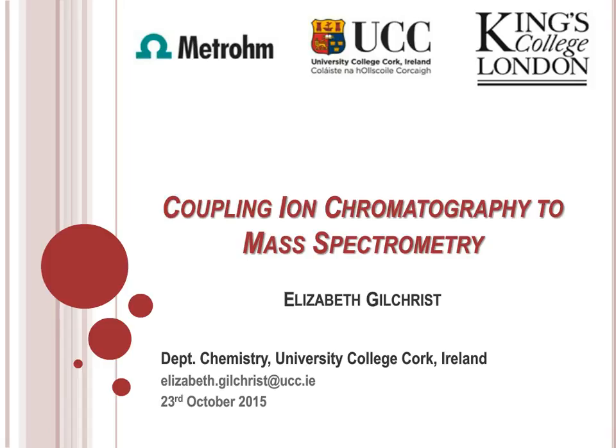Mass spectrometry is a preferred detection method for separation science due to its exceptional sensitivity, its ability to resolve co-eluting compounds, and the additional information it provides to the analyst for the identification of compounds. The coupling of ion chromatography to mass spec has never really been popular due to the high salt concentrations used in the elution of compounds from the ion chromatography column.